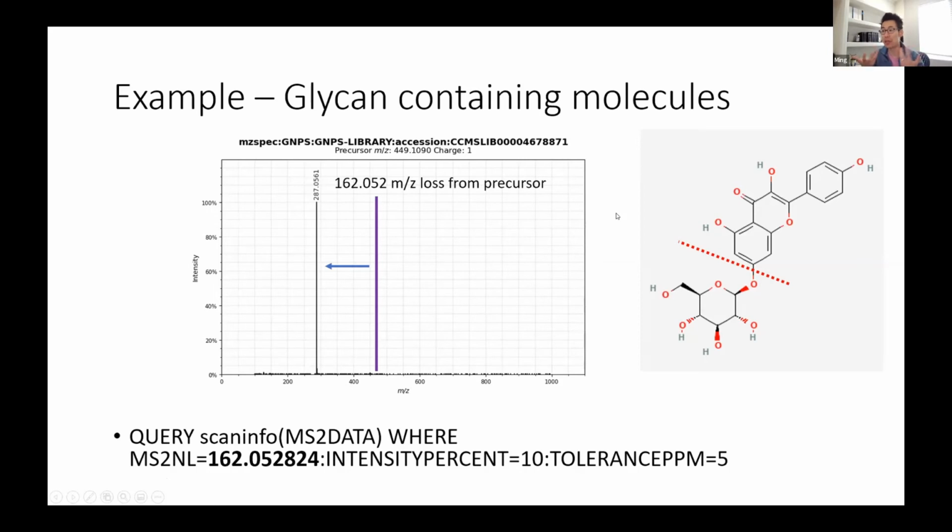And so what we've built out for the MassQL is a special interface that we call a sandbox. Basically, we're enabling you to query fixed data that gives you a bit of confidence in playing around with data, especially since it allows you to search against GNPS spectral libraries. And so we happen to know the compounds, and we know the compound names and the structures.